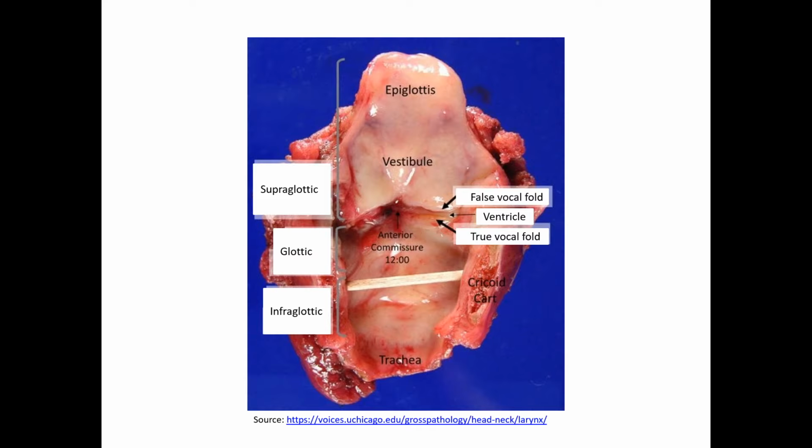Yes, absolutely. Okay. So can you tell the difference histologically between the true and false vocal folds? Theoretically, you can, because the true vocal cords have vocalis muscle and vocalis ligaments. So in a perfectly normal larynx at autopsy, or sometimes we get T1 disease and you get normal sections of vocal cords, or even if it's just an epiglottic tumor, that kind of thing, theoretically you can tell the difference. Unfortunately, when it's a glottic tumor, or most of the time when these larynxes come out, it's already involving this set of vocal cords, and half the architecture is obliterated.